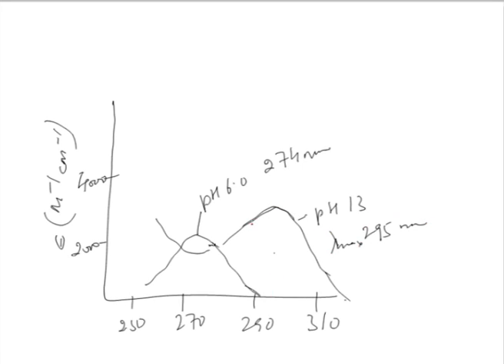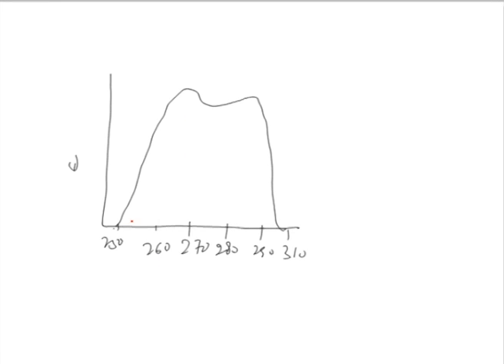So, what you see is that there is also an increase in the absorption coefficient. When it is done at two different pH values, the pH affects the lambda max as well as the molar absorption coefficient or extinction coefficient. Likewise, polarity or orientations will also affect it. For example, if solvent polarity has to be looked into, let us see how it affects the absorption. These are not very exact figures, but you can at least rely on them for understanding.